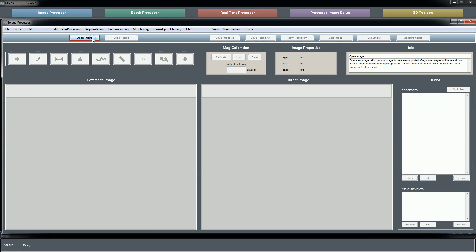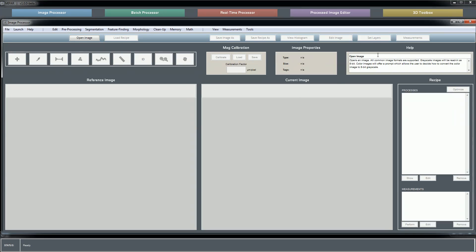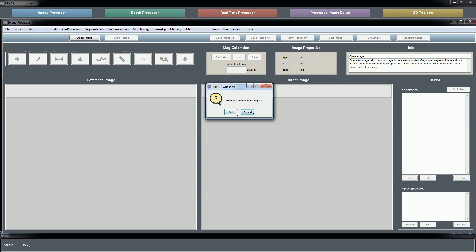Now with MIPAR being very early in the beta development stage, there will be a number of elements that when you right-click on them they'll say no help available, and that is something that we'll be filling out as MIPAR continues to develop. Reference image, current image, recipe panel - these will all be much clearer once we get into the other tutorials and you begin to use MIPAR. So I think that's about it for the image processor.